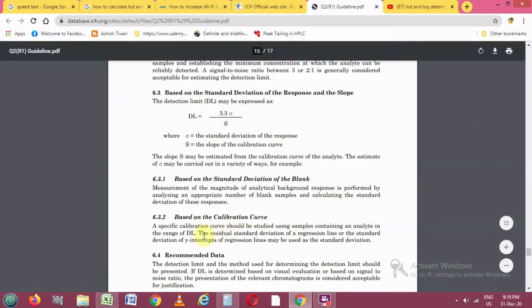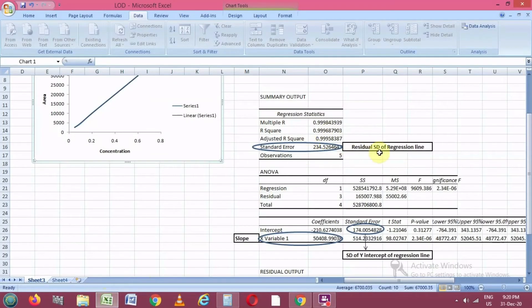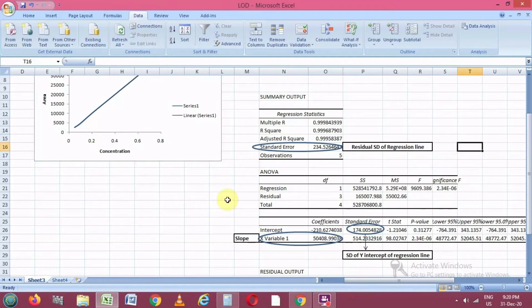We can match these values to our Y = MX + C equation. The slope value matches here, and the other important value is the Standard Error of the Y-intercept of the regression line. These two values — the residual standard deviation of the regression line and the standard deviation of the Y-intercept — are used in the calculation of LOD and LOQ.